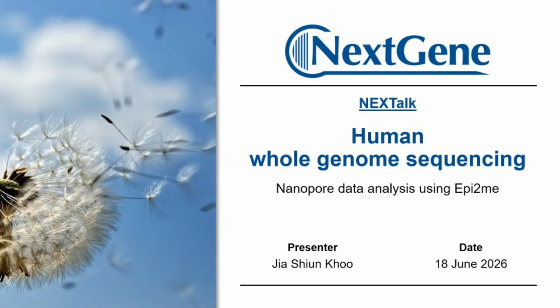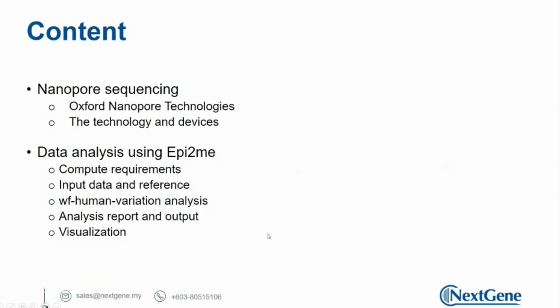Without further ado, let me start the session. Before we go into the human whole genome sequencing data analysis, we will rehash a little bit on nanopore sequencing, particularly Oxford Nanopore Technologies and their devices. Then we will jump straight into EPI2ME for the data analysis.